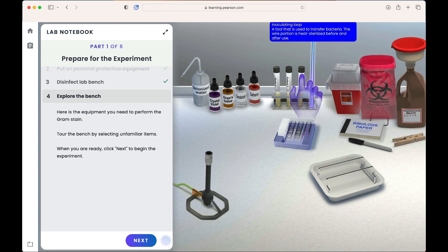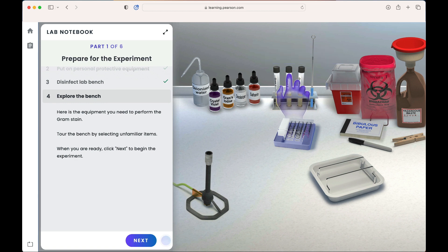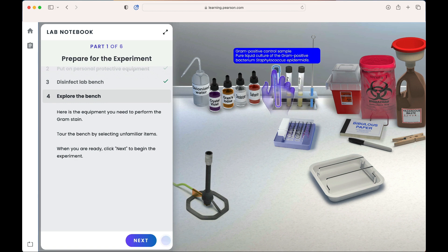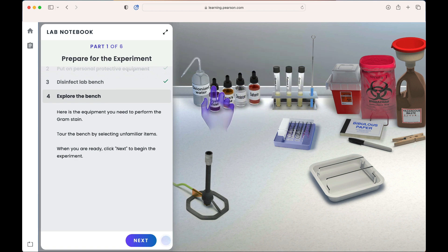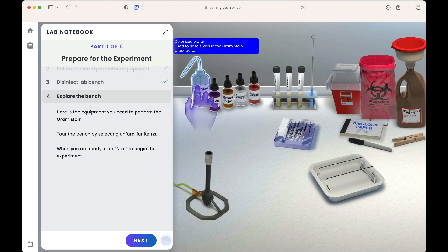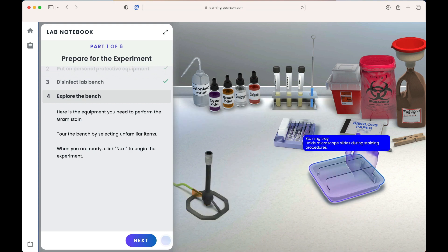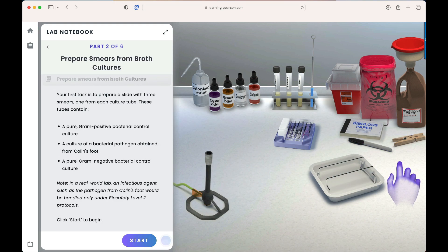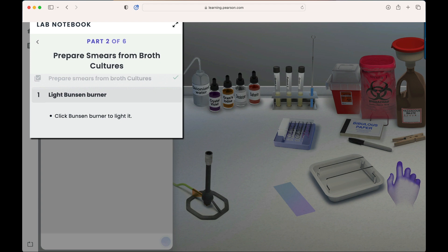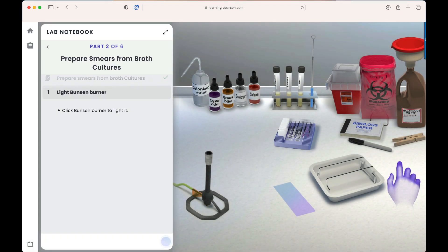Each lab emphasizes critical thinking skills and lab skills, along with techniques used in the physical lab setting. In the gram stain lab, students are asked to perform a gram stain on the pathogen from Colin's foot. To do this, we will prepare smears from broth cultures. As you can see in our lab notebook on the left, our steps are clearly laid out for us to follow.